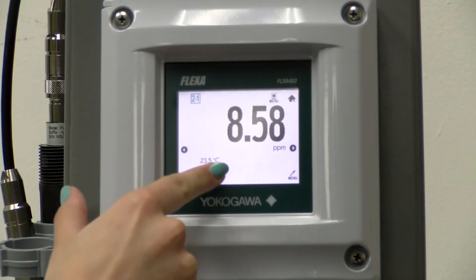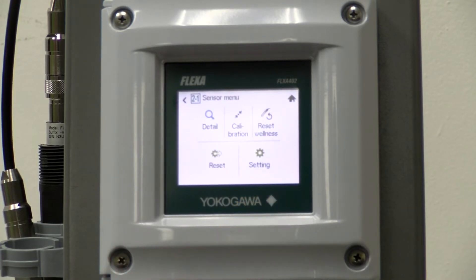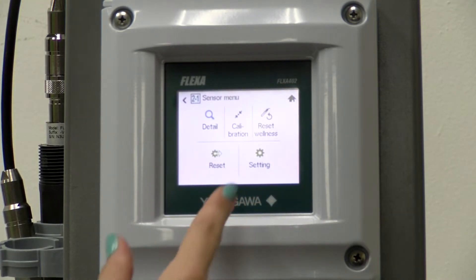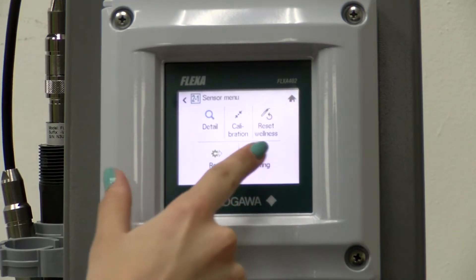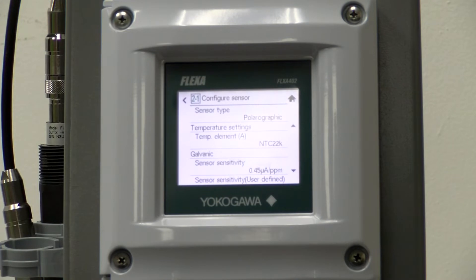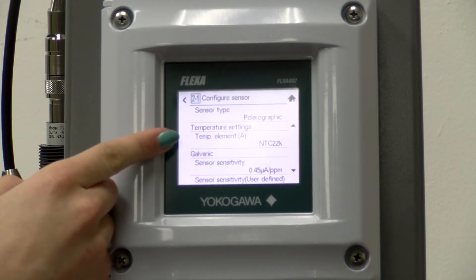First we need to go to the correct channel, then we need to go to the sensor menu in the bottom right corner, then settings and configure sensor. You need to choose the appropriate settings for your sensor. For the OxyGold G, we are choosing a polarographic sensor with the NTC22K temperature element.